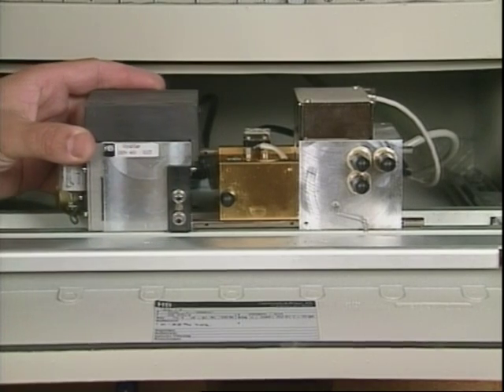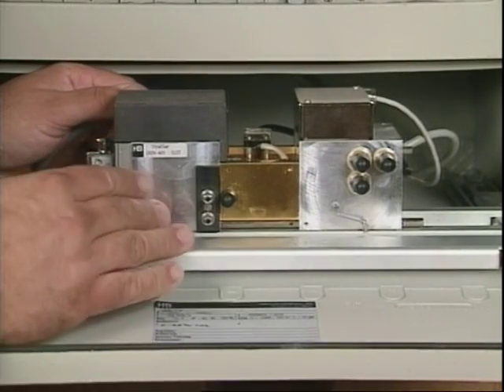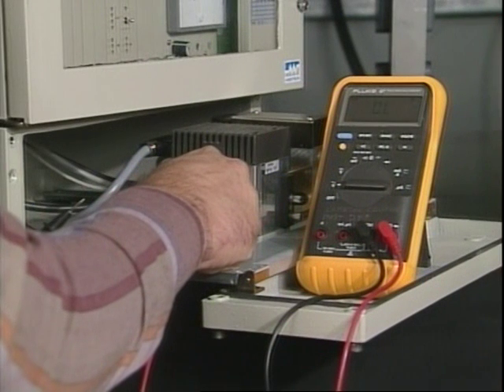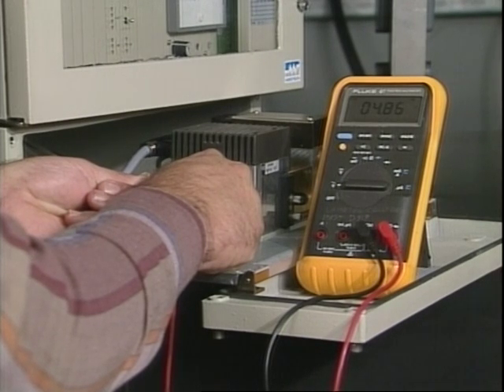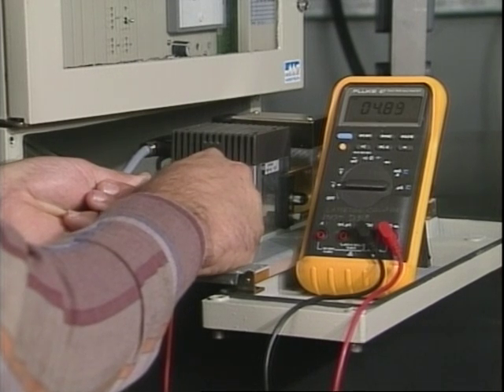Realign the chopper wheel module and reconnect the signal wires. If the motor still does not operate, troubleshoot the motor control circuit. Refer to the manufacturer's instructions for procedures specific to your analyzer. If the motor is out of sync, adjust it according to manufacturer's instructions.